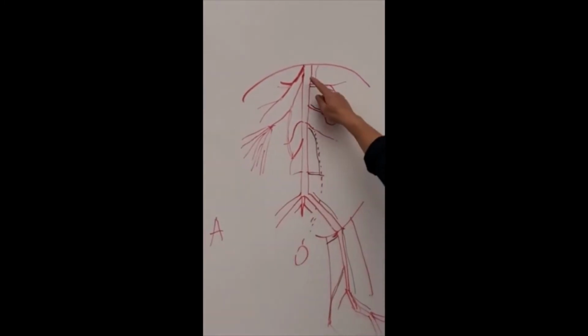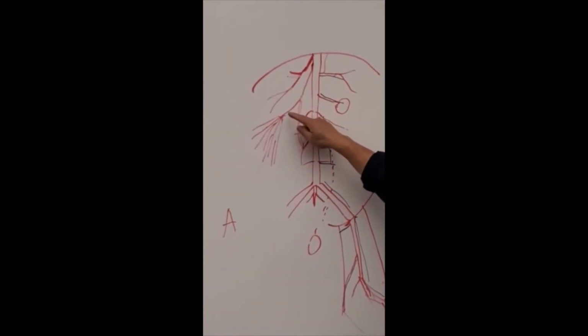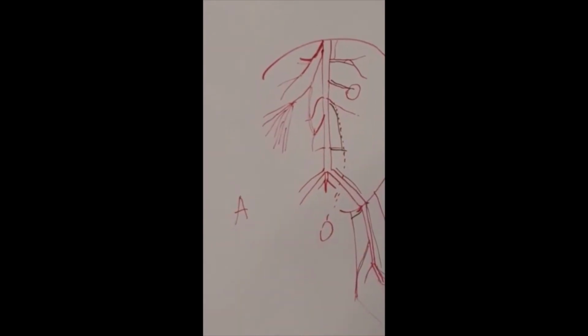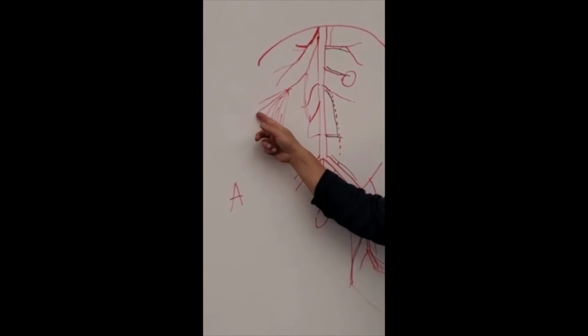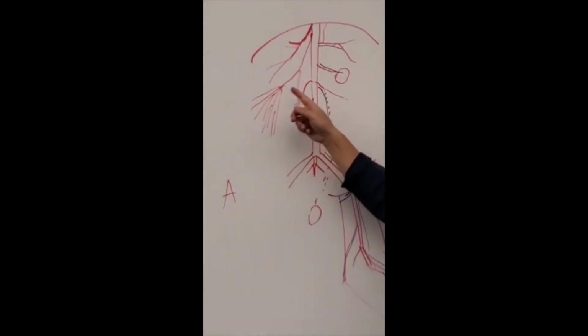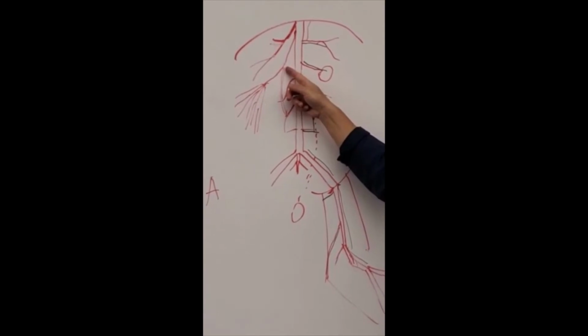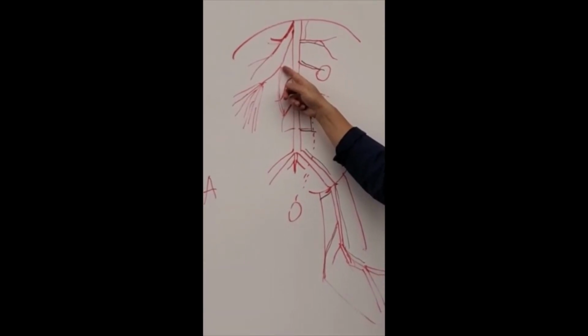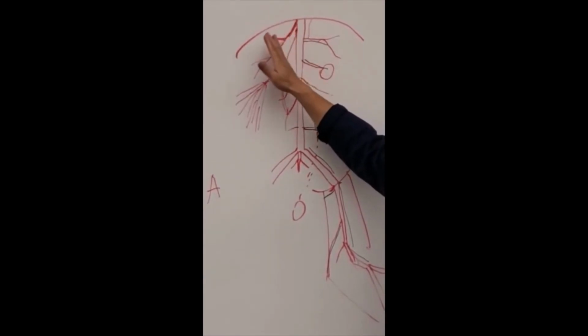Okay. Next to it, very close. Okay, superior mesenteric. Most of the superior mesenteric supplying the small intestine forms the intestinal. Okay. There's one early branch supplying the colon, descending colon. We call it colic. Okay. That's on this side. You figure out these two first.